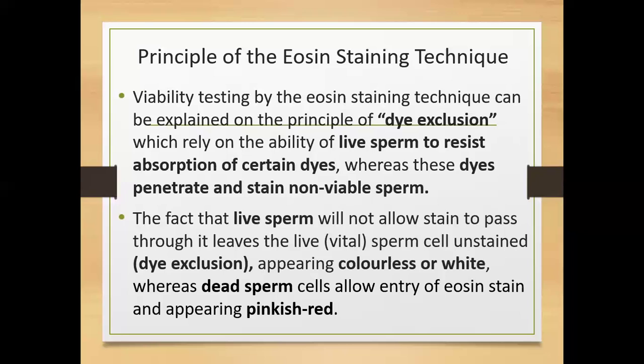All right, so the cell membrane is protecting the cell itself. If it's not dead, it will not allow macromolecules like the stain to come and stain it. It will keep it out. At the end of the day, when you are looking at a stain material, you are looking at the color that it will impart.